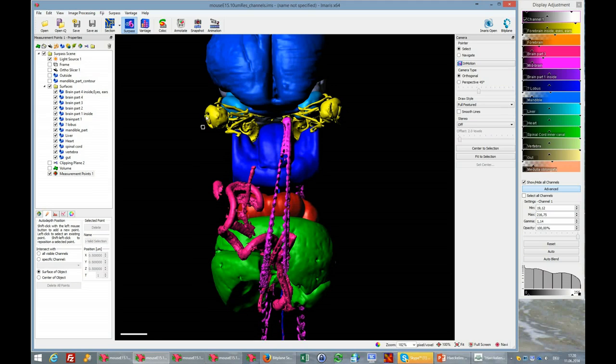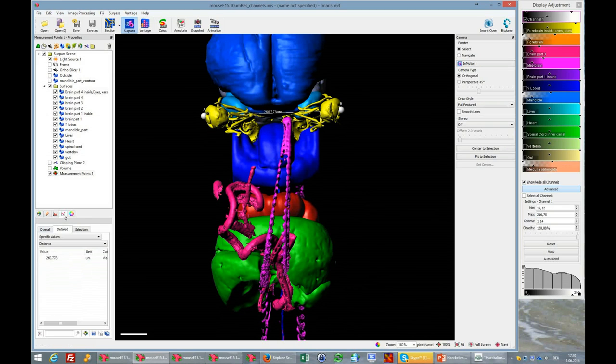So I position my mouse pointer here, and this little cube you see will jump to the position in 3D space where you want to start to measure, and you press Shift and left mouse button, and on the other side as well, and you will see you get a line which shows you this distance. And of course, all these statistics you can later export with this little floppy icon to files, Excel files or CSV files, for instance.